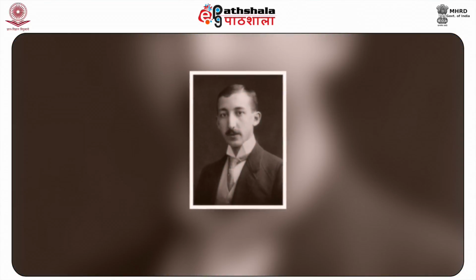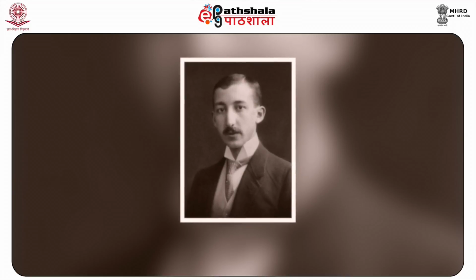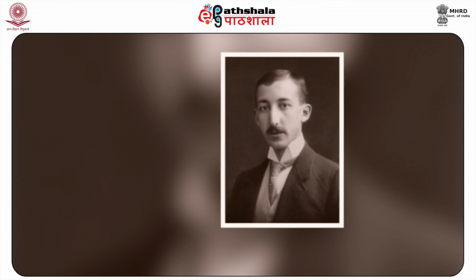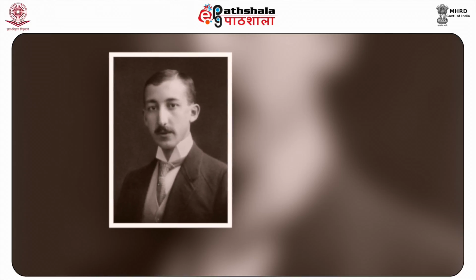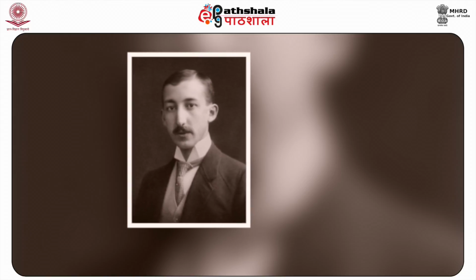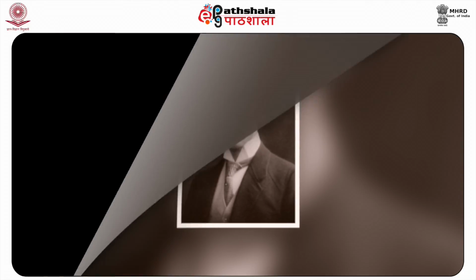Neutron activation is a general term for irradiating material with neutrons to create radionuclides. Neutron activation analysis was discovered in 1936 when Hevesy and Levi discovered that samples containing certain rare earth elements became highly radioactive after exposure to a source of neutrons.